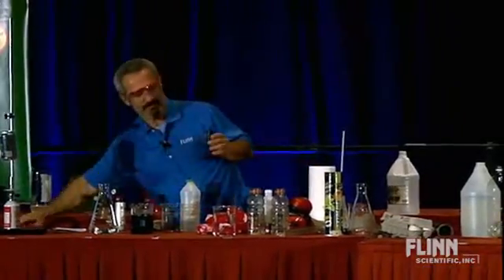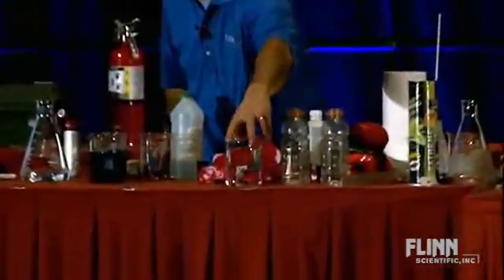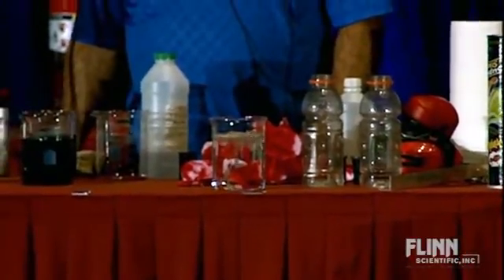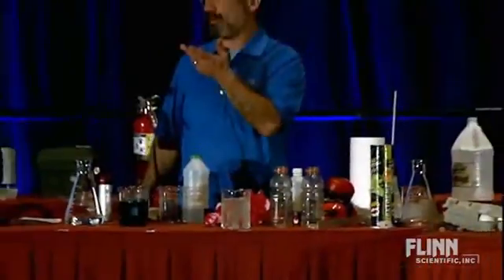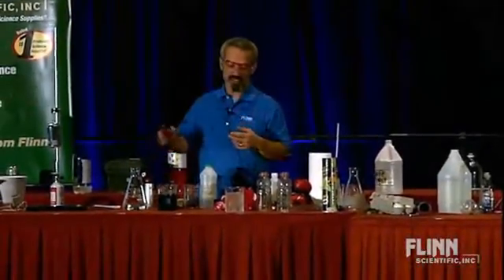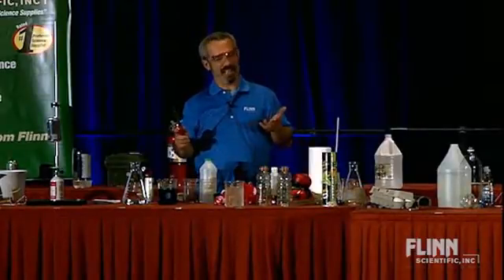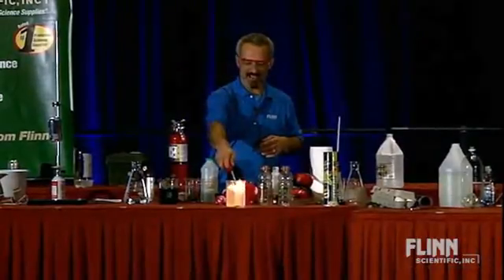It reacts vigorously with water — bubbling away. So I wonder what kind of gas that is. You think that's carbon dioxide? Hydrogen? Actually, that is acetylene gas, and you get a nice little flame maintained there.